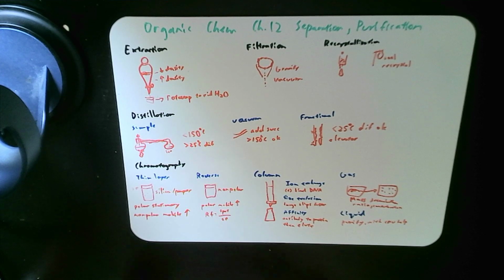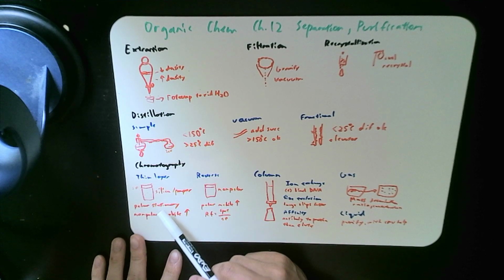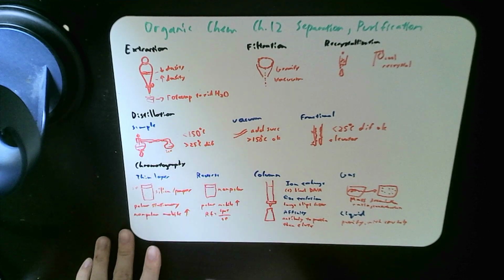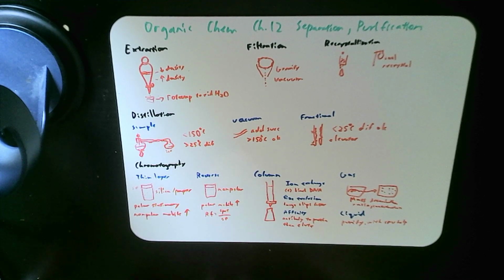So you have the solvent front. The solvent usually is nonpolar and travels upwards. The higher up you travel, the faster you travel with the solvent. If the solvent is nonpolar, the ones that move up the furthest are the nonpolar ones in the mobile phase, and the polar ones are stationary because they stick to the silica and paper much more.